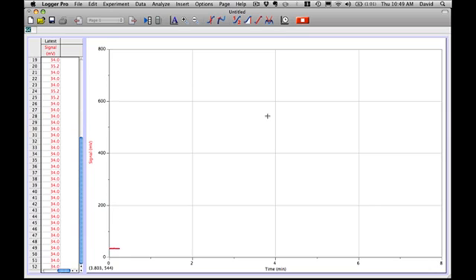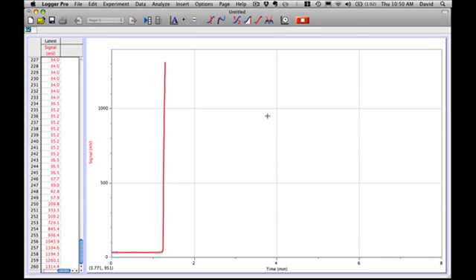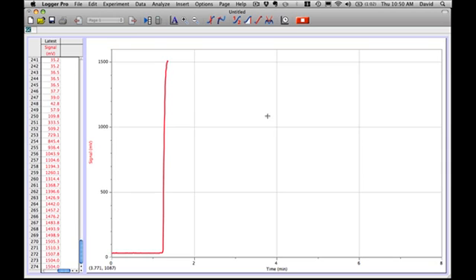What we hope to see, if our parameters of temperature and pressure are set properly, is that fairly soon the first substance will have traveled through the capillary column and will be picked up by the detector. When that happens, the millivolt readings will change rather quickly and drastically on the computer screen. First substance coming out of the column.